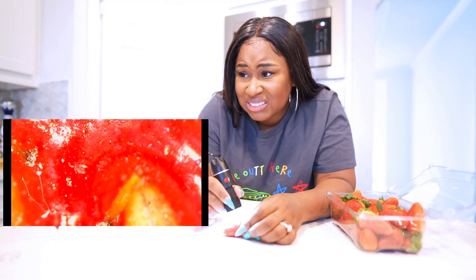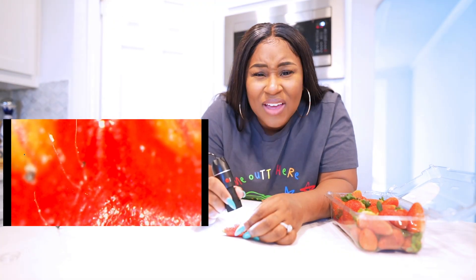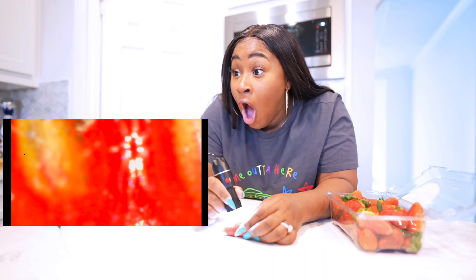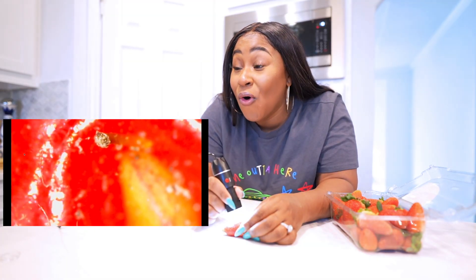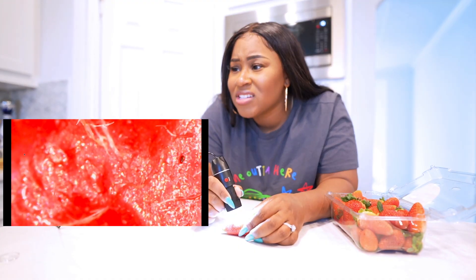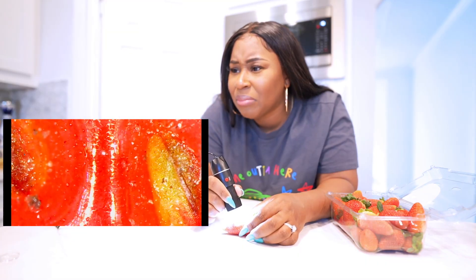That doesn't look cute, does it? What is that? Do y'all see that flake? Wait — strawberries have hairs? Ew, that is not cute. Oh my gosh. I didn't know strawberries have hairs! Look at that — what is that poking out of it?